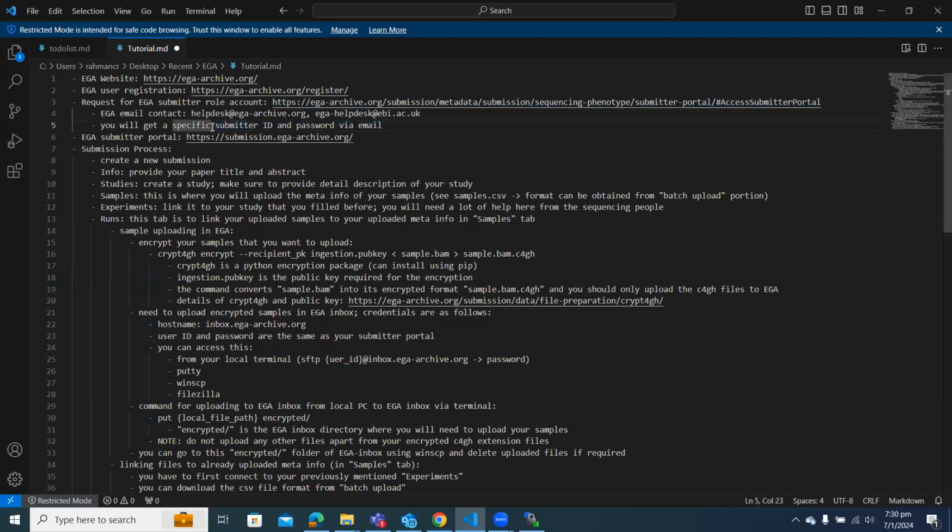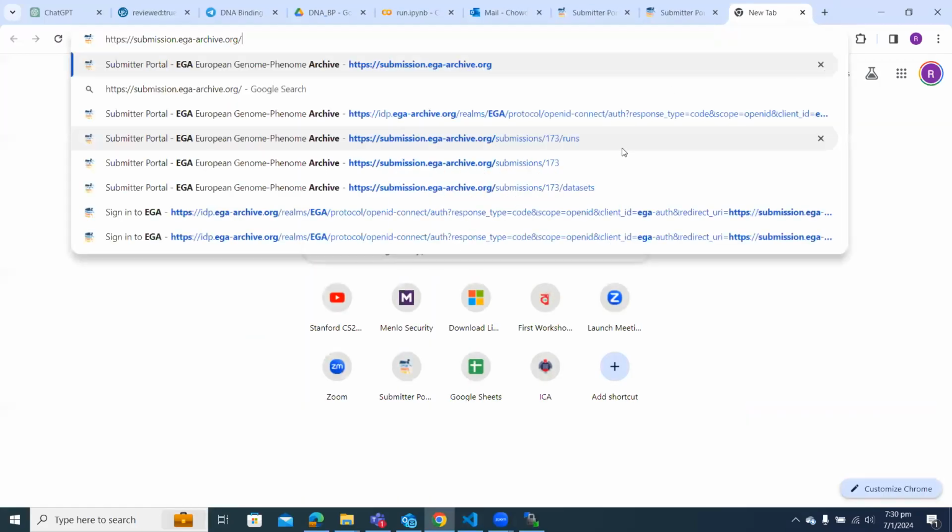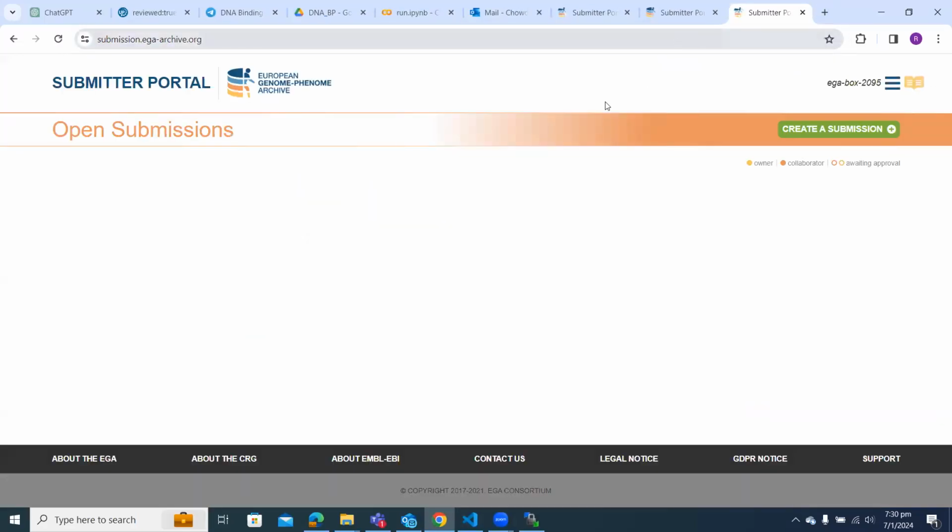So now, if you have these two things, you want to submit your study, right? So what does it look like? Let's take a tour. First of all, this is the submitter portal. If you go to the submitter portal, we take you there. You are not going to get to this page right away. First of all, you need to input your user ID and password. Then you are going to go to this page. Okay. You can just create a new submission.